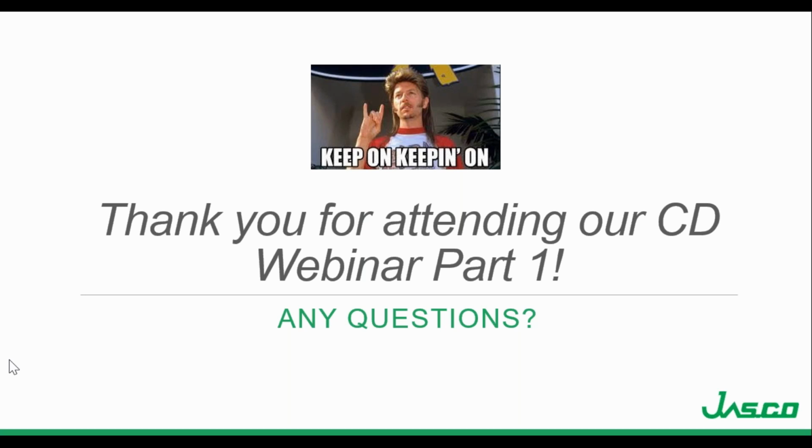Can I run multiple samples in cuvettes? Yes. There's a couple ways I could answer this question. If you have a multi-position Peltier, we have a 6-position, so you could do 6 different samples, one right after the other.